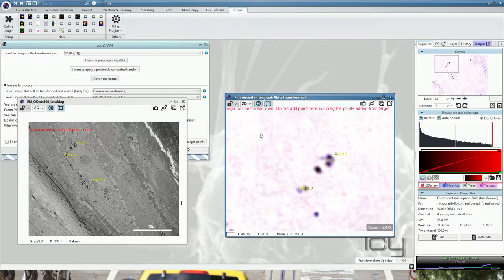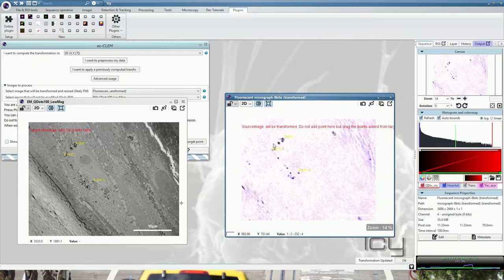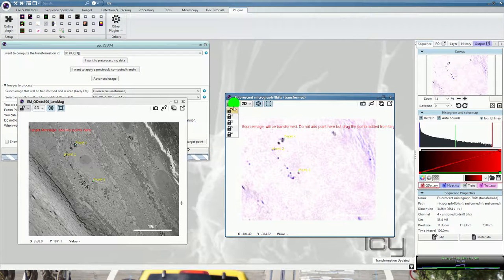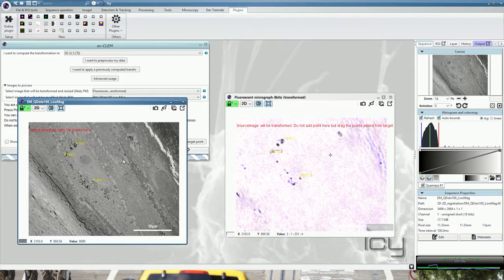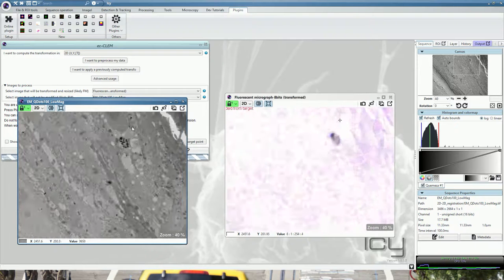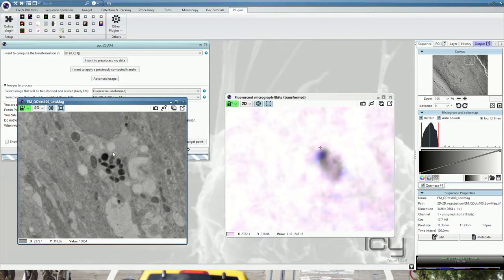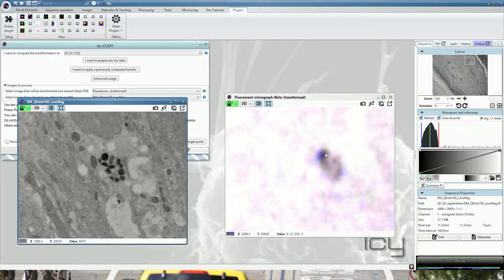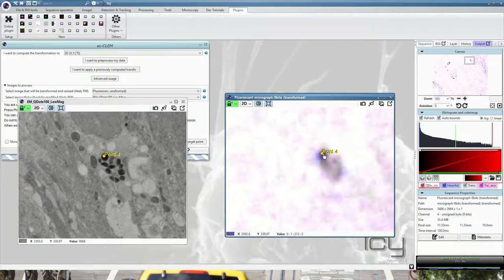The two images are now similar to one another and you can link them together to ease your registration. When you zoom in one image and you have your mouse on the left hand, you have a cross on the right hand and vice versa. Now place a point here and adjust.